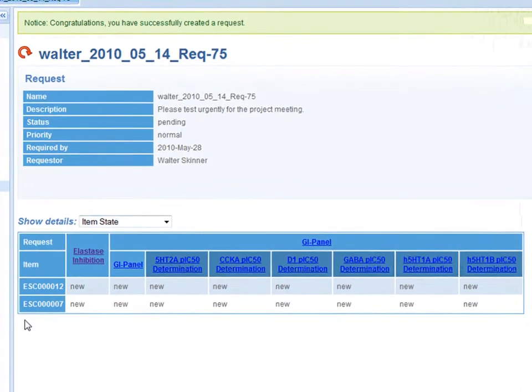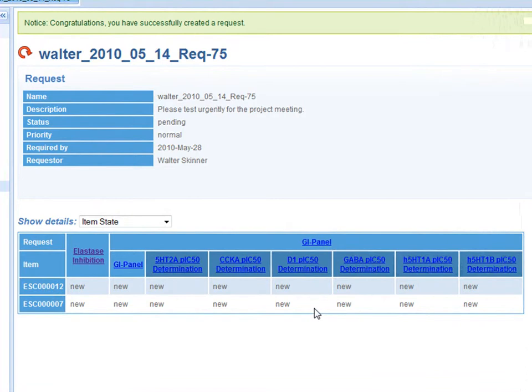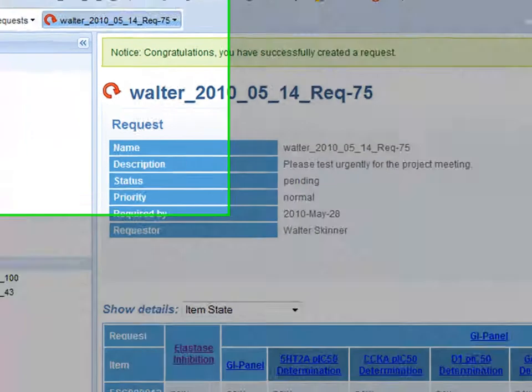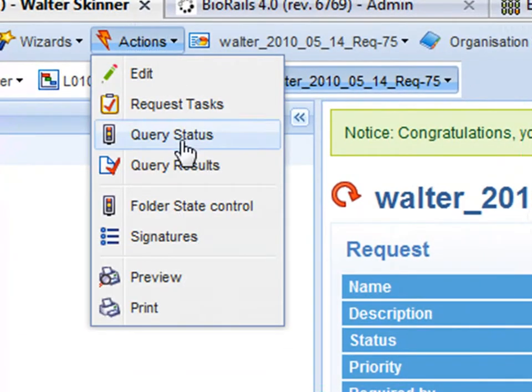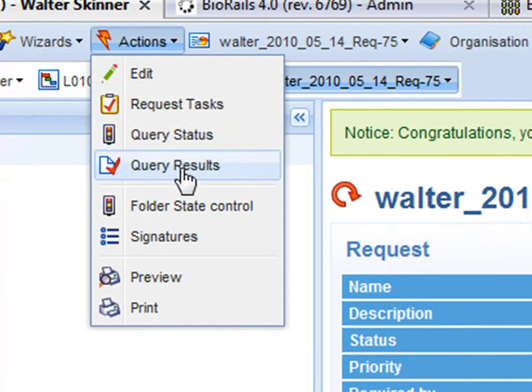I can see at the moment that all my requests are brand new and nothing is going on with the request. From this dashboard we can check the status of all the requests for each service against each compound. Once those services are complete we can access the results directly from the request.